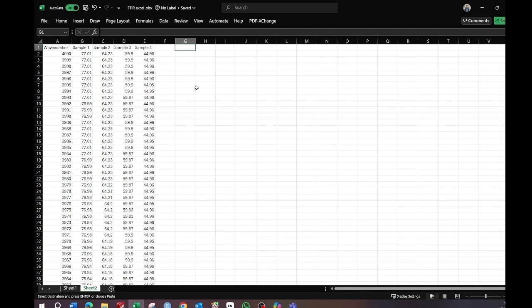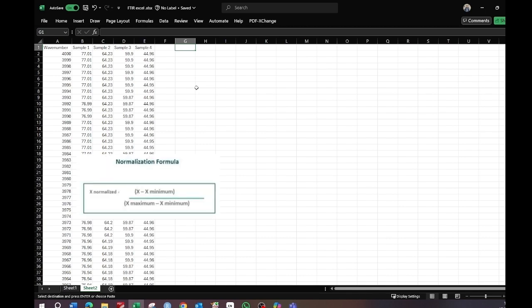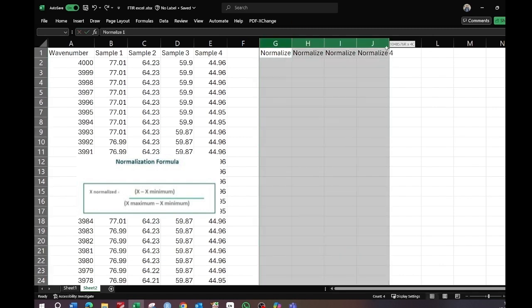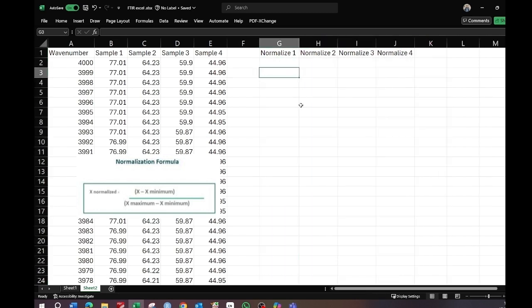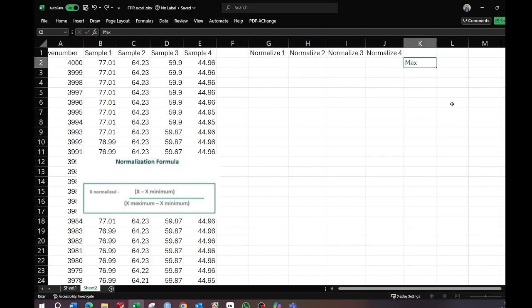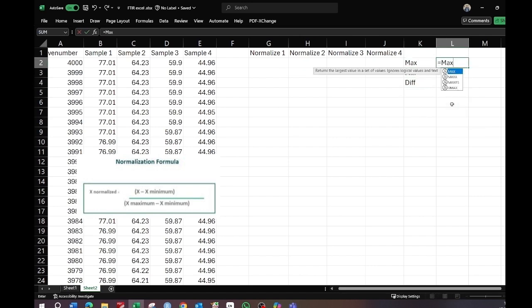We will normalize all of the data for all of the samples using this formula. We will normalize each of the data — normalize one, two, three, and four. In the formula we need the maximum and minimum values, so we will find the maximum and minimum value for each dataset. Find the maximum using the MAX function and go to the column B.